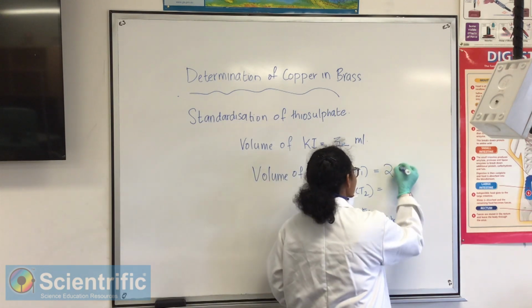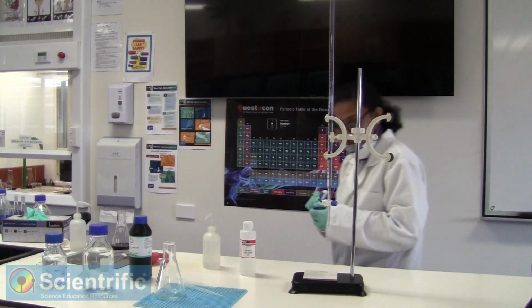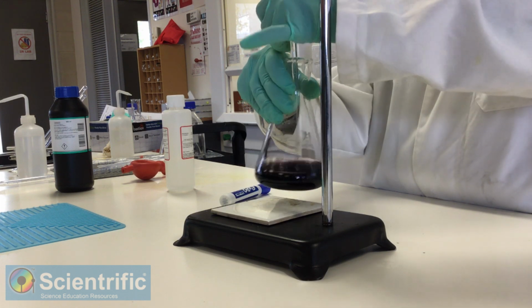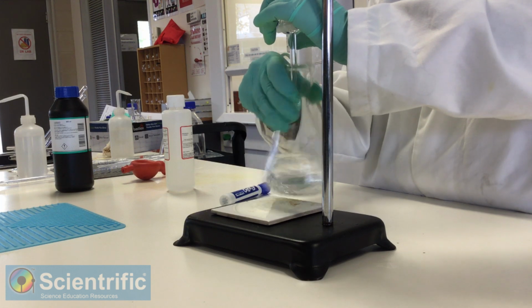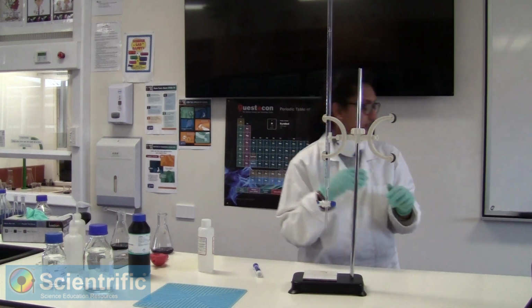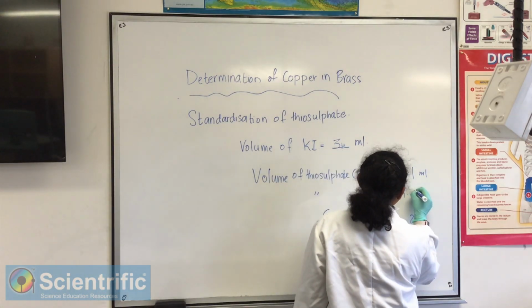So that's because we had to change the solution, we had to redo both the experiments. Now we need to do the second one. That's about there. Yes, and that's our endpoint. And that comes to around 9.2 mils.